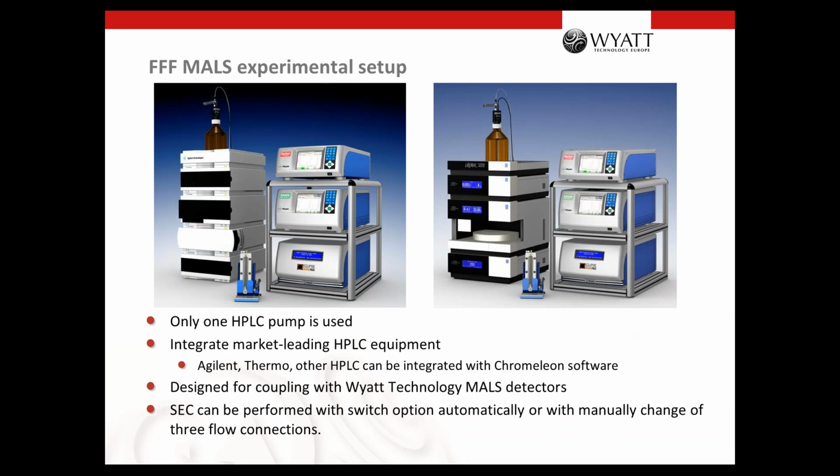Yeah, here again, you see the HPLC setup with the Wyatt instruments in a rendering. So the FFF setup is a one-pump solution. All the other flows are generated just by the splitting of the pump with some valves. And we integrated the software control in the Agilent ChemStation software or in the Chromeleon software from Thermo.